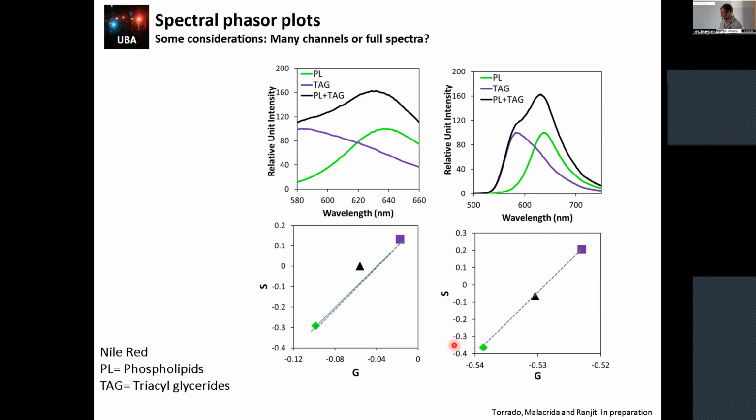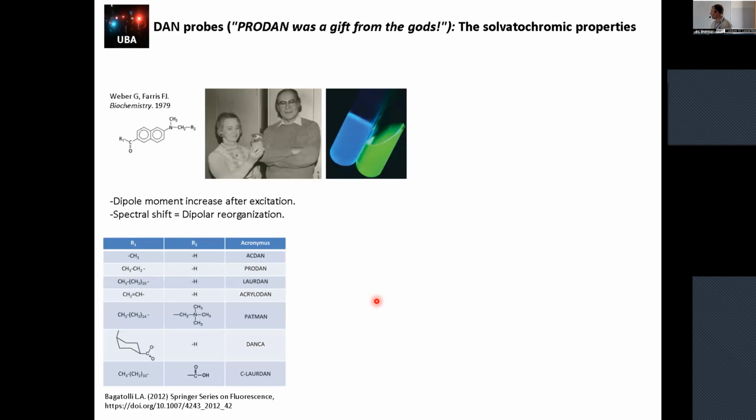You do the previous one, where you have the 2 pure points, and then the linear combination. You see that the point is outside of the linear combination because you broke the linear combination by not having the total decay of the spectra, and this is really, really important.